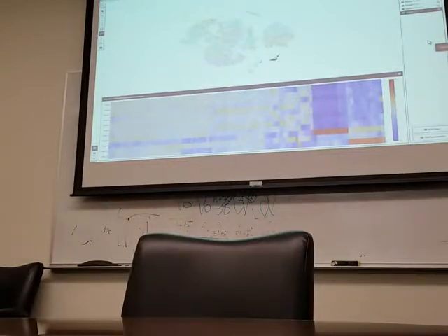So you did the t-SNE plot, just the output sort. I don't know why that's not obvious, but in this case it was just like a negative selection, so that might be a good approach if that's what's driving these separations. And maybe we don't necessarily have to re-import it back into this, but use something like Seurat.